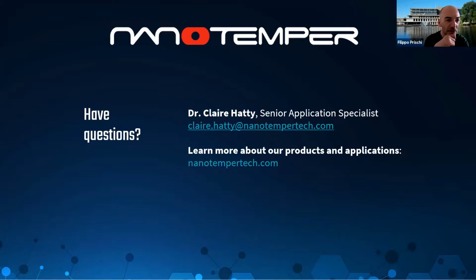So it doesn't matter how many things you put inside the assay? No, it doesn't matter how many things you put in. I guess what matters more is, can you deconvolute? Can you understand what's actually happening? But definitely, competition assays are very common, say if you have a tracer ligand. I think one of our most common examples is having fluorescently labeled ATP and competing that off.